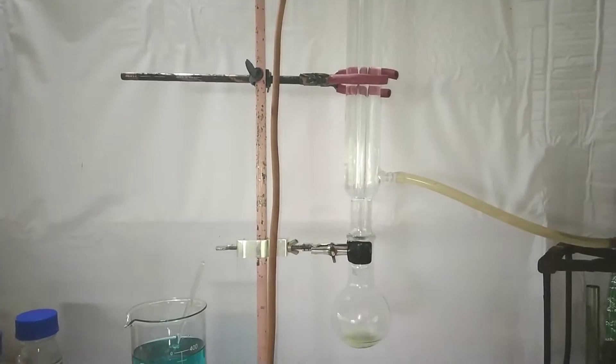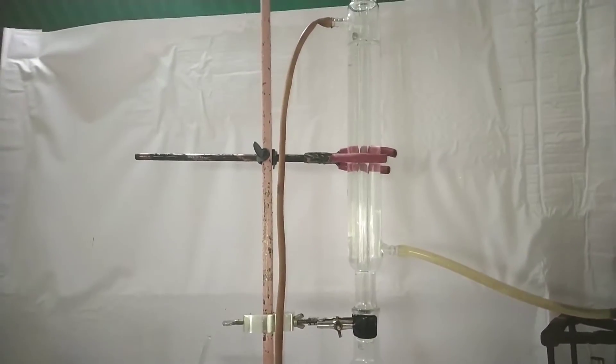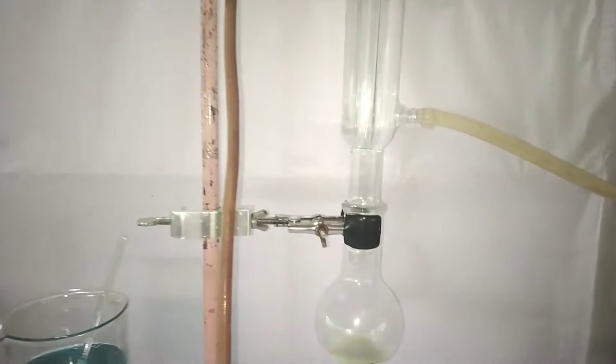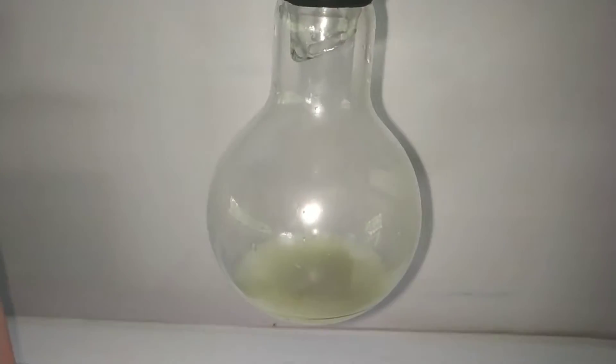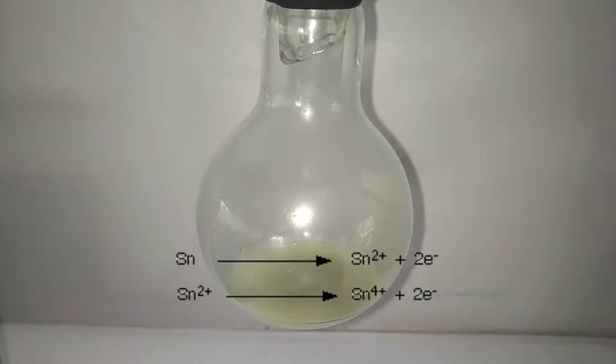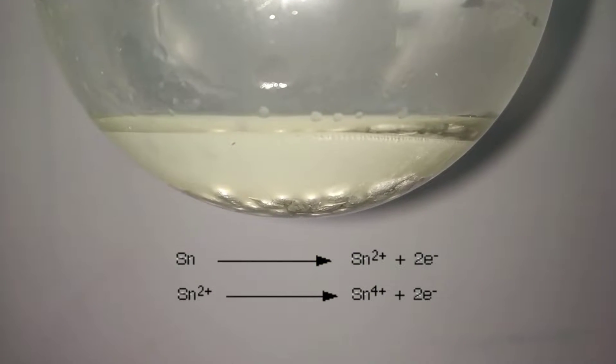This is the whole setup of the reflux. You can see that in the flask a vigorous reaction has already started to take place. Tin metal reacts with the acid forming tin 2+ and tin 4+ releasing electrons.